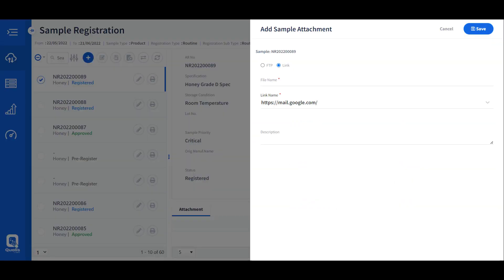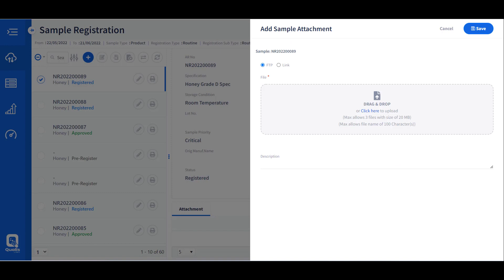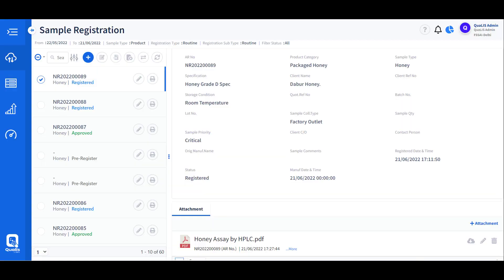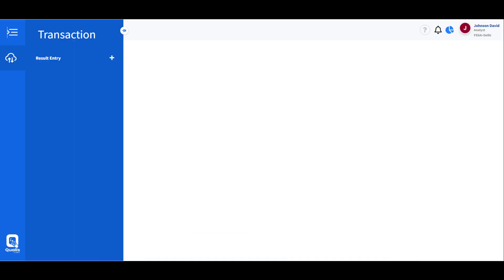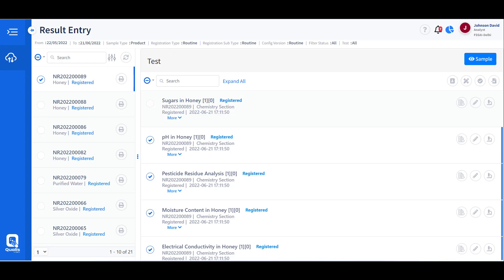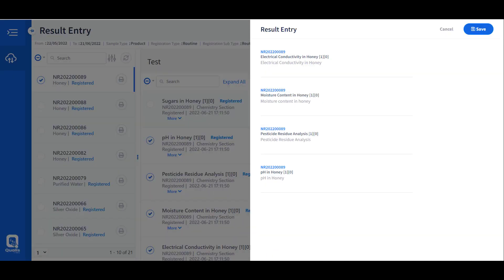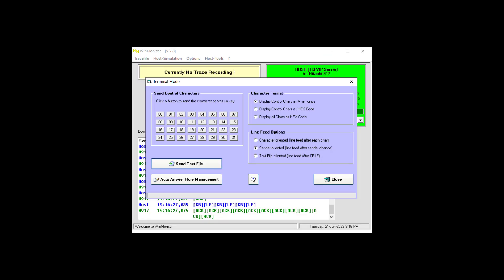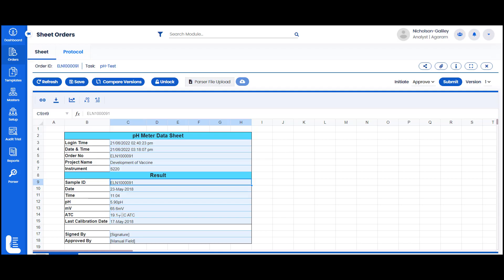Any additional information received from the sample owner or client can be associated as an attachment to the respective sample, which can be passed on to the analyst, reviewer, and approver for verification. The sample then moves through the result entry process, where the analyst is presented with tests belonging to their own area or section. The user accepts the test to perform and starts result entry, which can be done manually or via instrument interface.